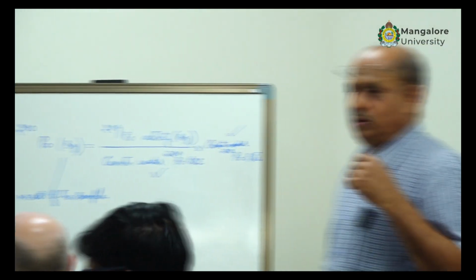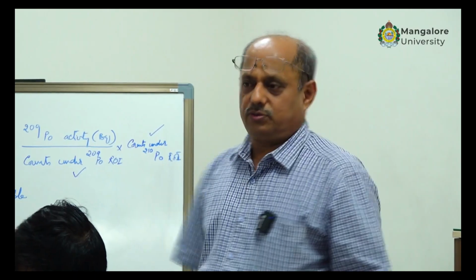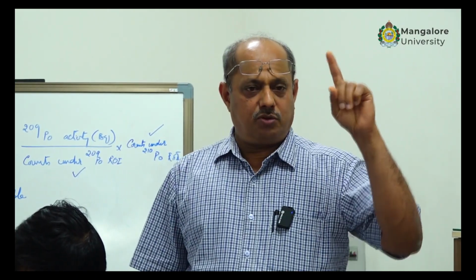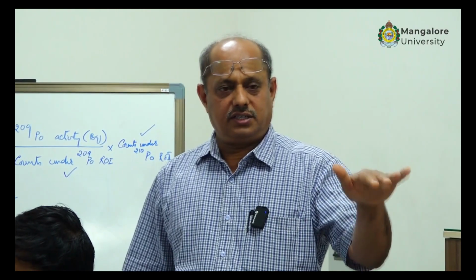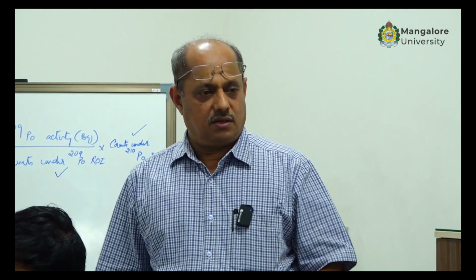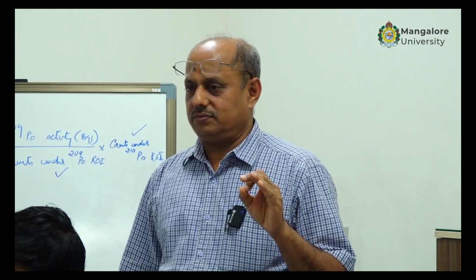Okay. So yesterday we loaded a phosphogypsum sample, and yesterday we kept one for plating deposition. So later, after you finish the gamma spectrometry, if any one of you wants, or as a group, you can go there and remove that silver plate.